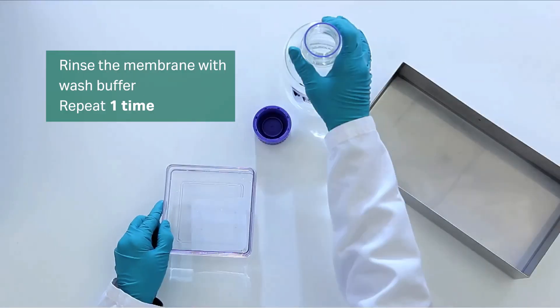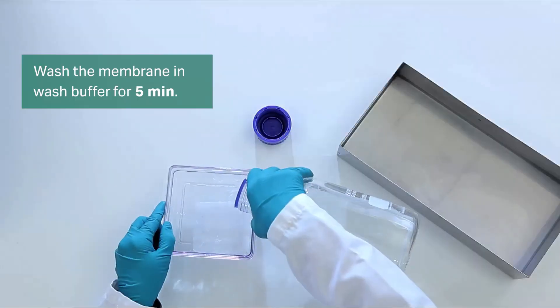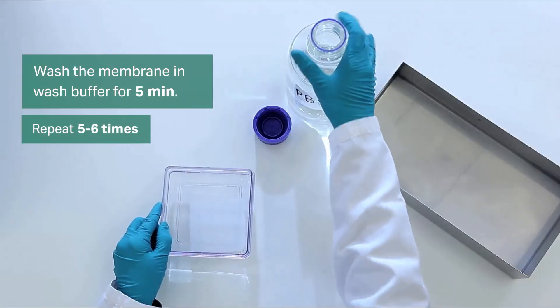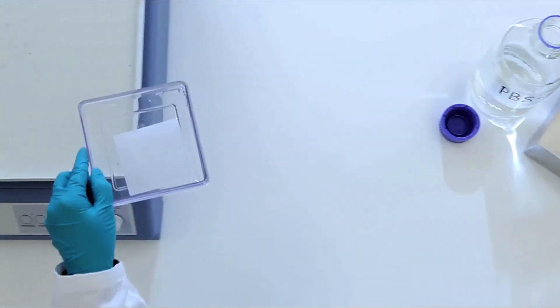Finally, rinse the membrane twice with wash buffer, then wash in wash buffer for 5 minutes. Repeat 5 or 6 times. Now we're ready for the detection reagent.